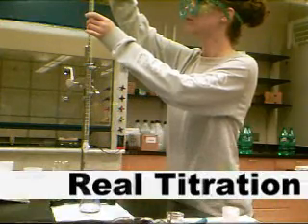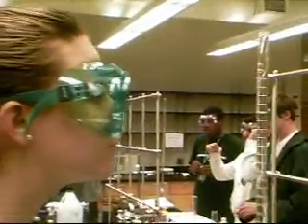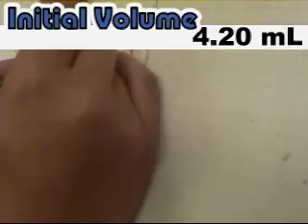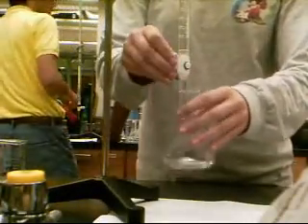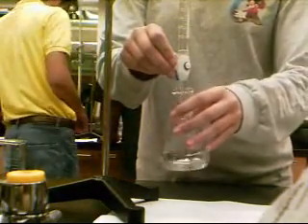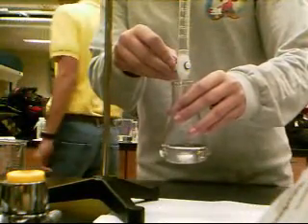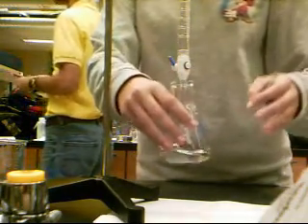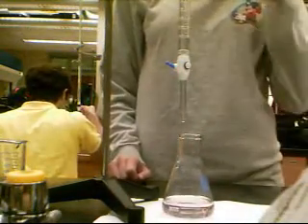Now that a rough estimate has been calculated, it is time to perform the real titration to determine the actual volume of titrant needed to neutralize the analyte. In this trial, our initial volume is 4.20 mL. Repeat the steps taken to perform the sloppy titration, including preparing the flask, filling the buret, recording the initial volume, and releasing the valve to allow titrant to flow into the flask. This time, however, when the volume being added approaches the estimated volume needed, we will slow to a dropwise addition of titrant.